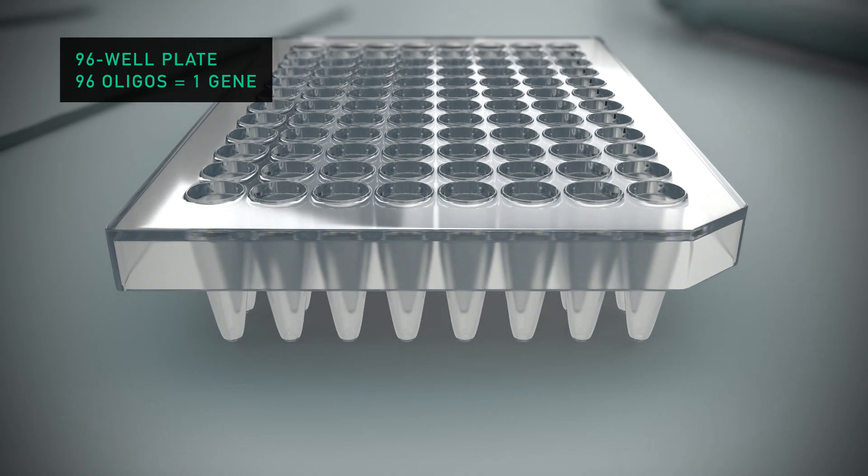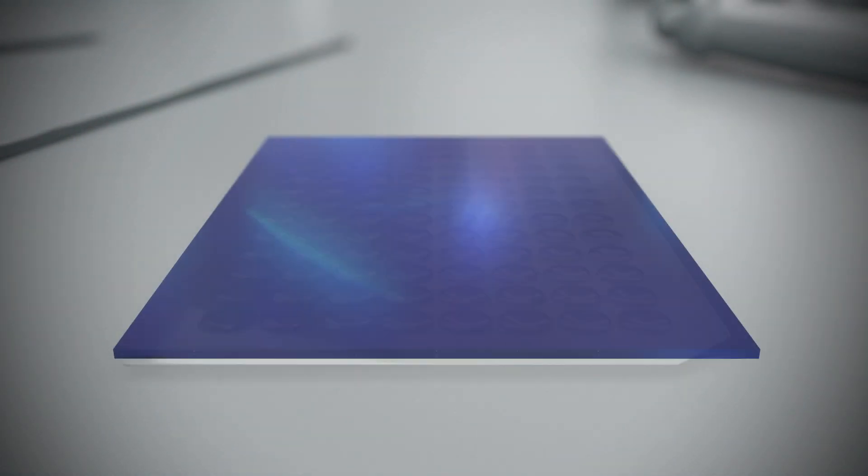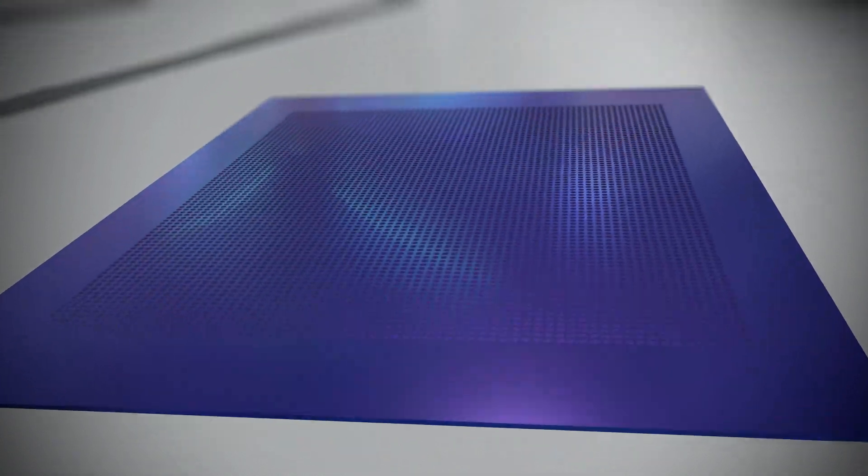Twist Bioscience starts with a plain silicon wafer, like those used in the semiconductor industry.